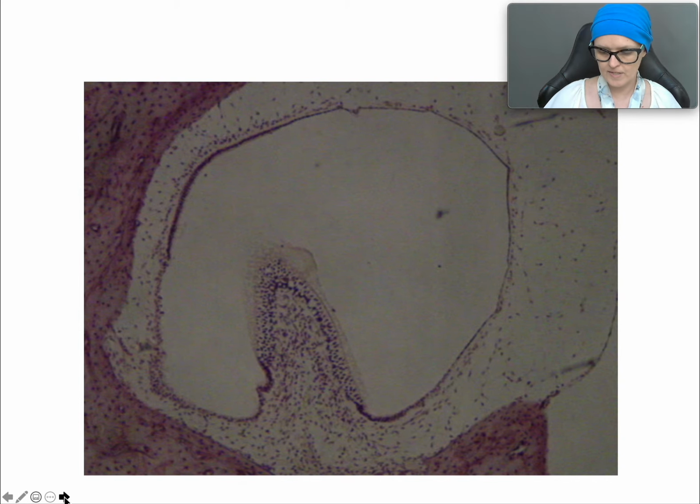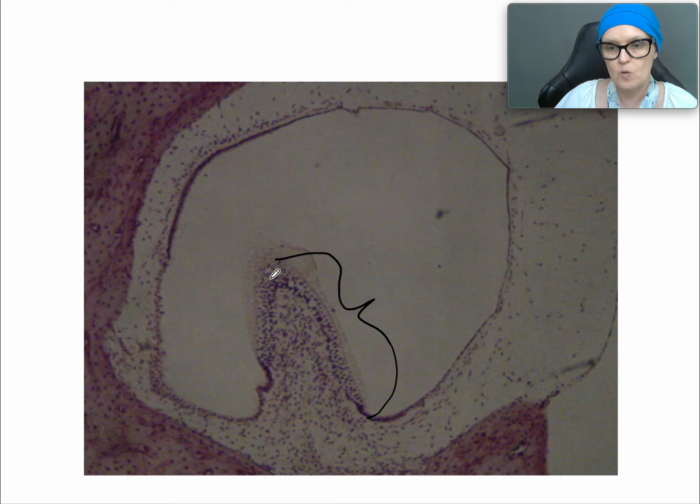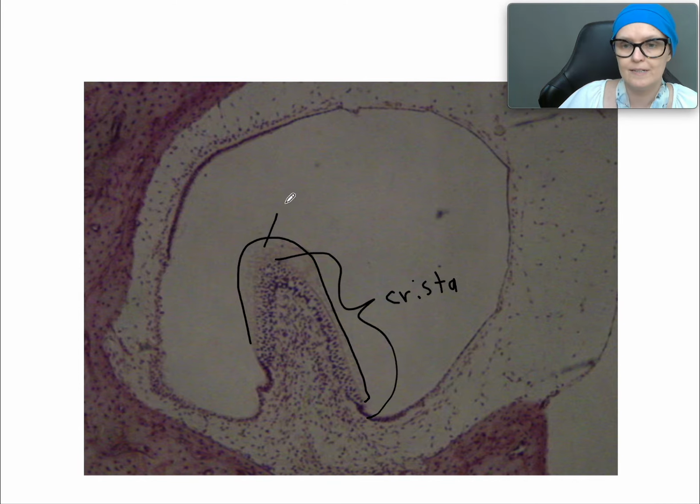Okay, so we're skipping in the book on now to page 8. And what slide is this? This is the crista ampullaris slide. So the crista, I'm supposed to ask you the question, not tell you. Is this whole peninsula here the crista? And then this little thin layer, you can barely see it. This is the cupula.